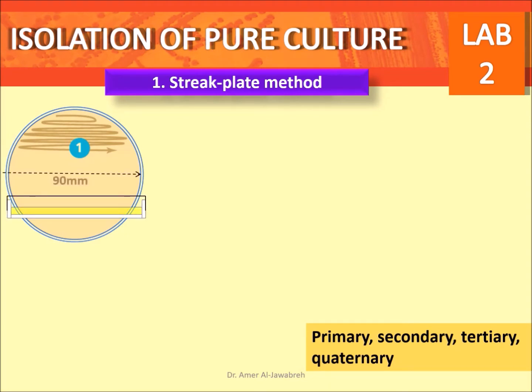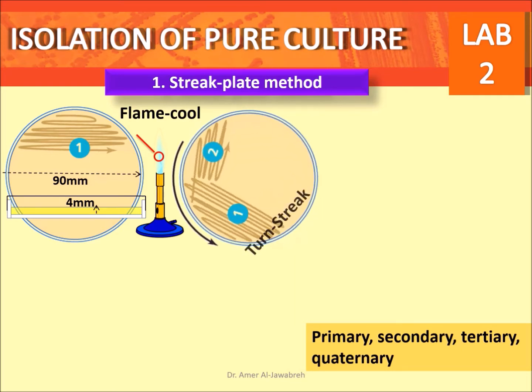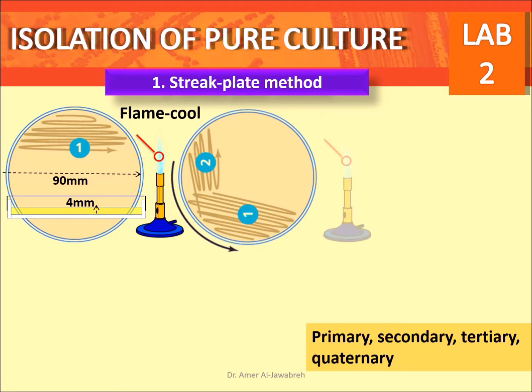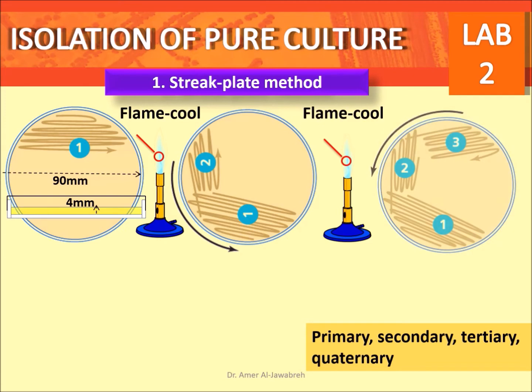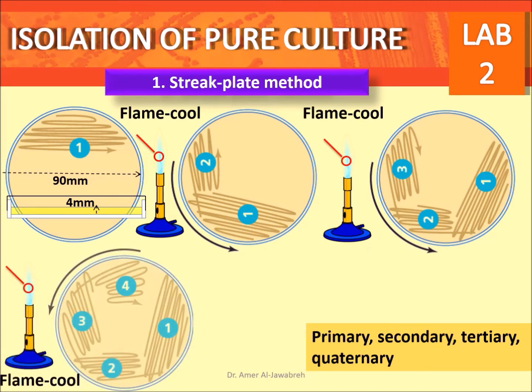Third, pour plate method. First, streak plate method. Using a 90 millimeter plate with 4 millimeter agar thickness, streak the plate 4 times: primary, secondary, tertiary, and quaternary, with 7 to 9 lines back and forth reaching the edges of the plate. Flame and cool the loop. Turn the plate 90 degrees, repeat streaking, but only the first line drawn should touch the previous streak. Repeat tertiary and quaternary streaks in the same way. Flaming between streaks and touching the previous streak once results in final separated colonies. In case of using disposable loops, replace the loop after each streak.